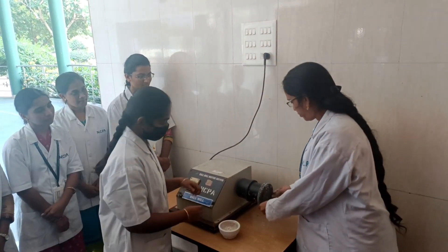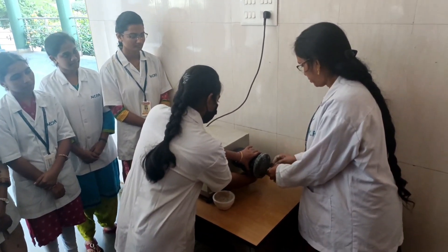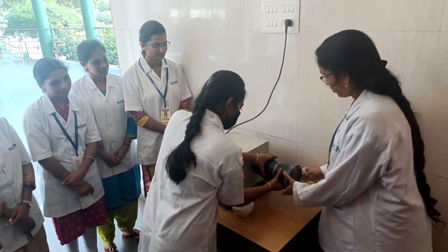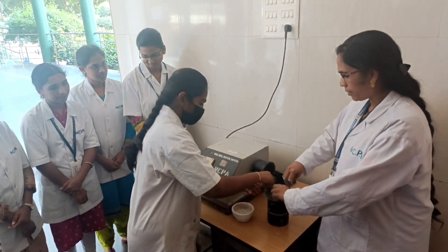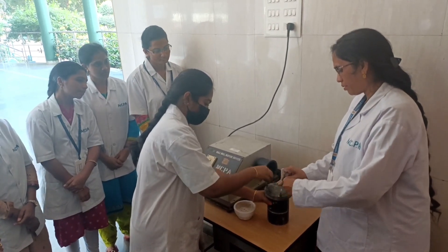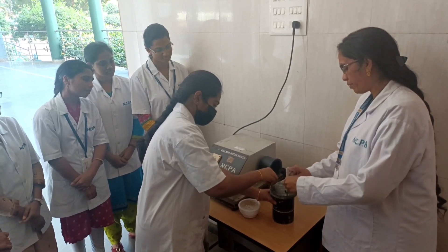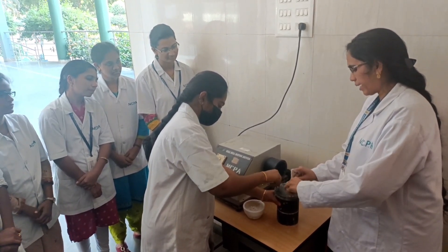Now we will see the product. We can detach this hollow cylinder like this, and afterwards we can remove the fine-sized particles from this hollow cylinder.